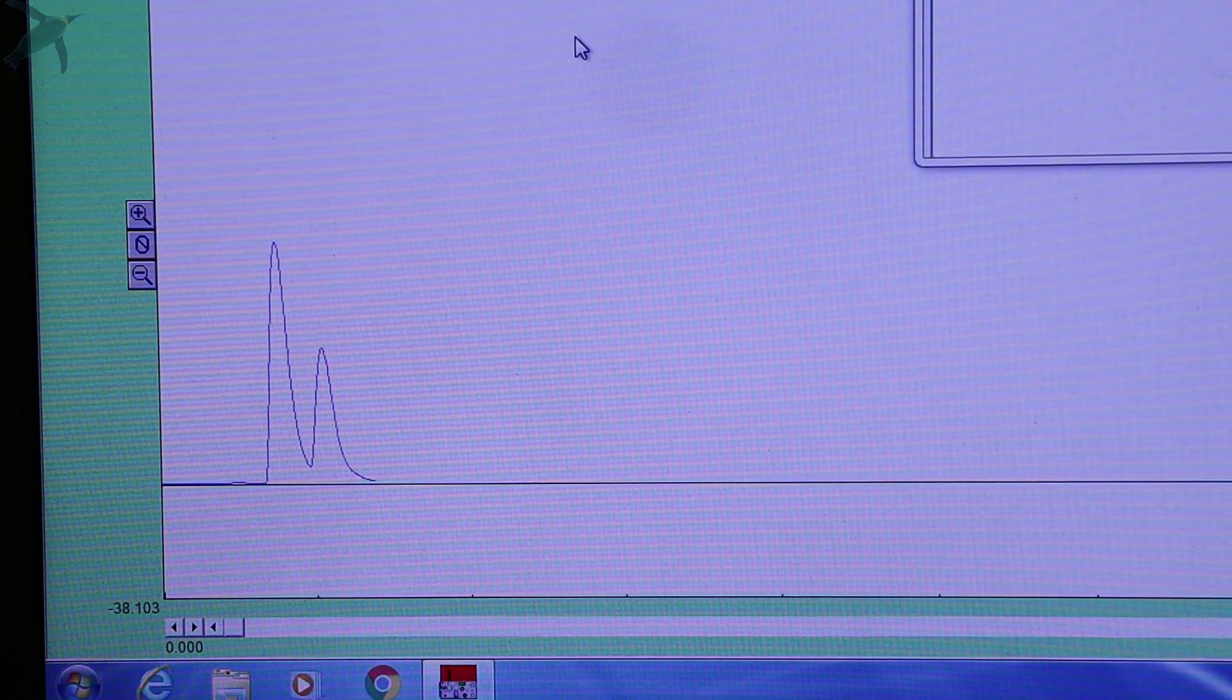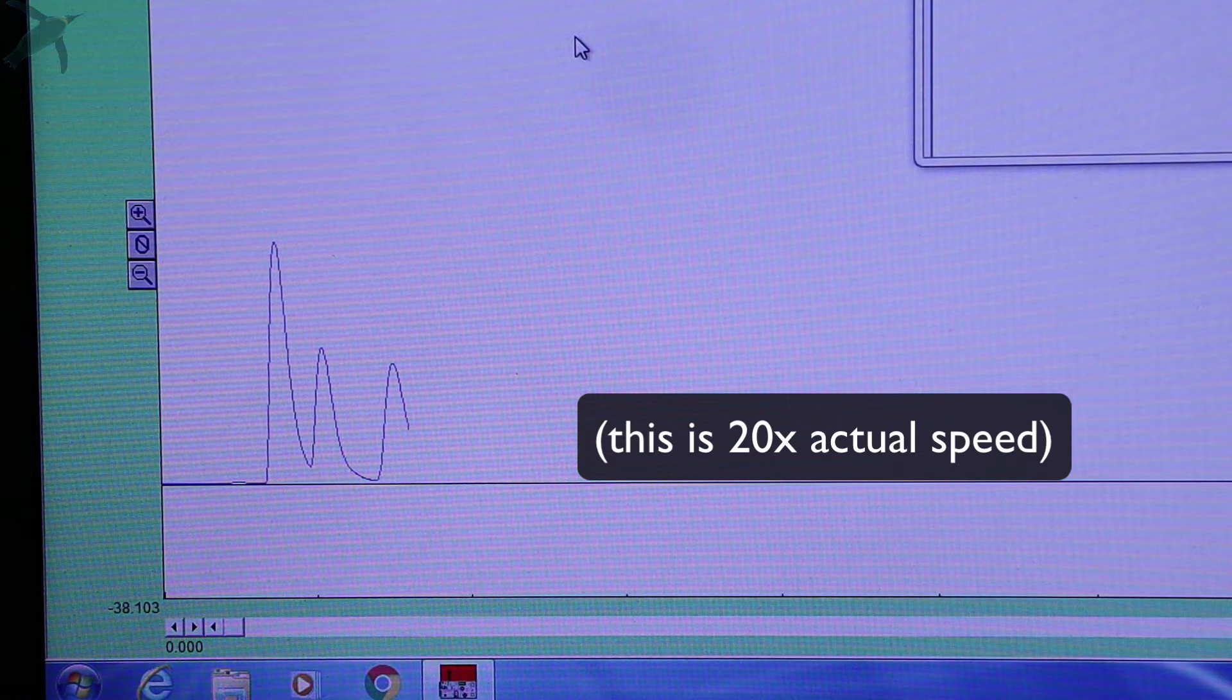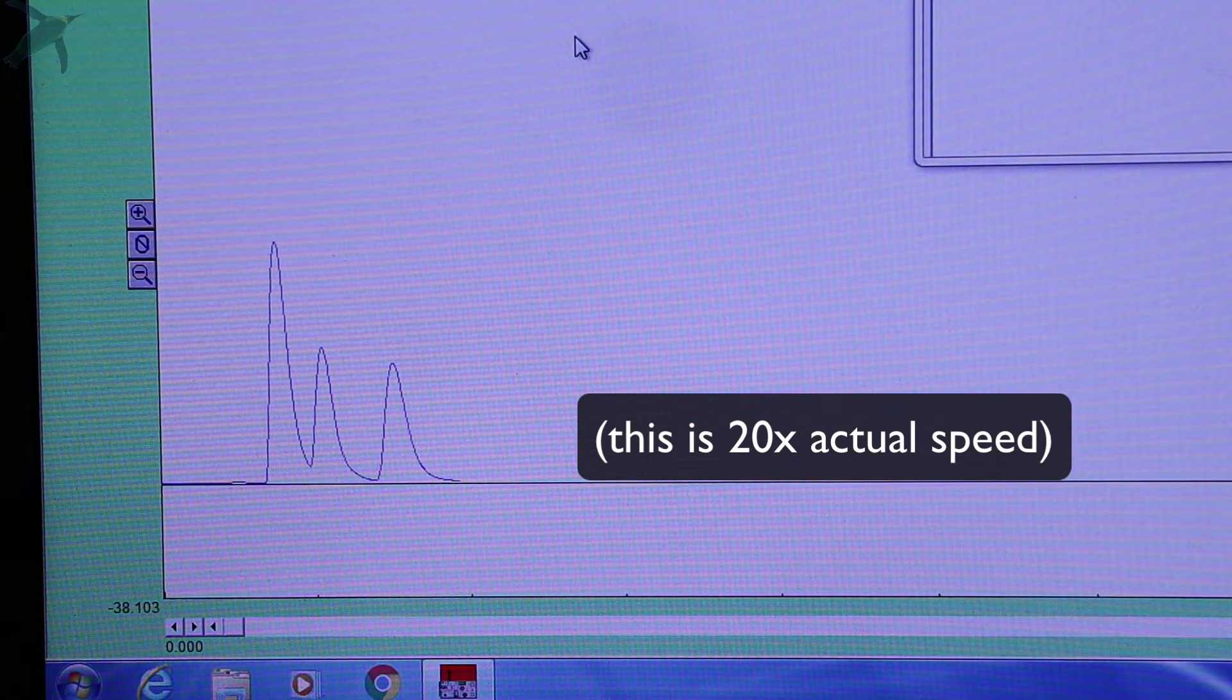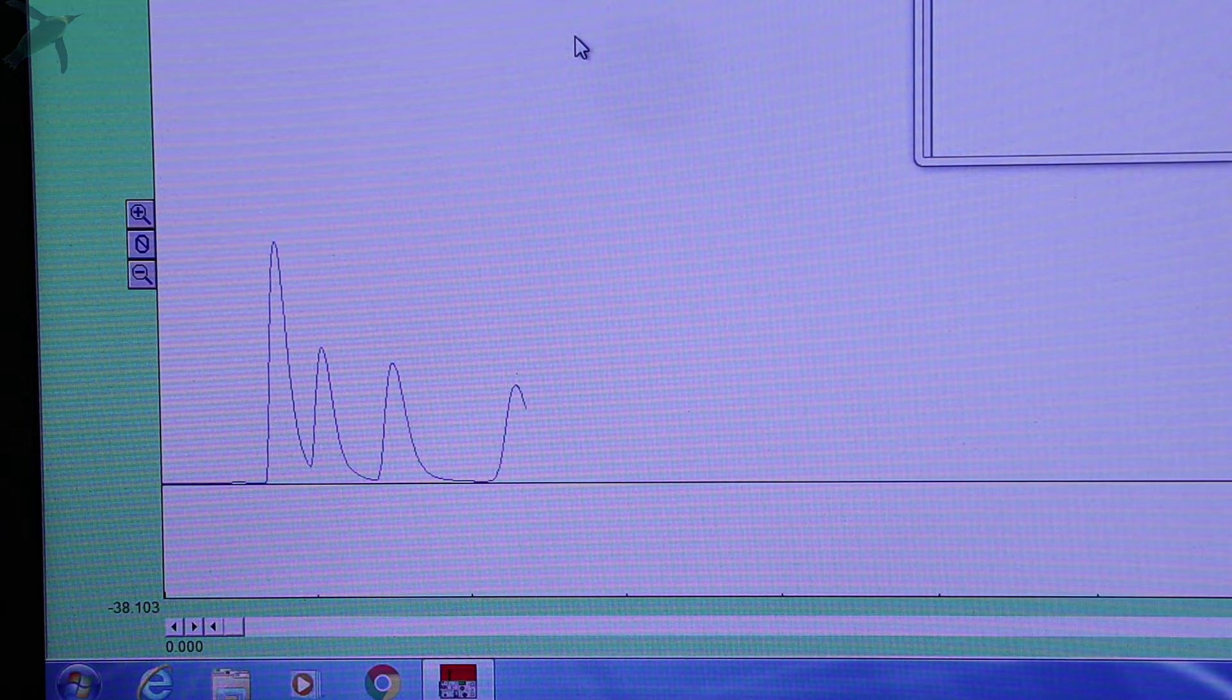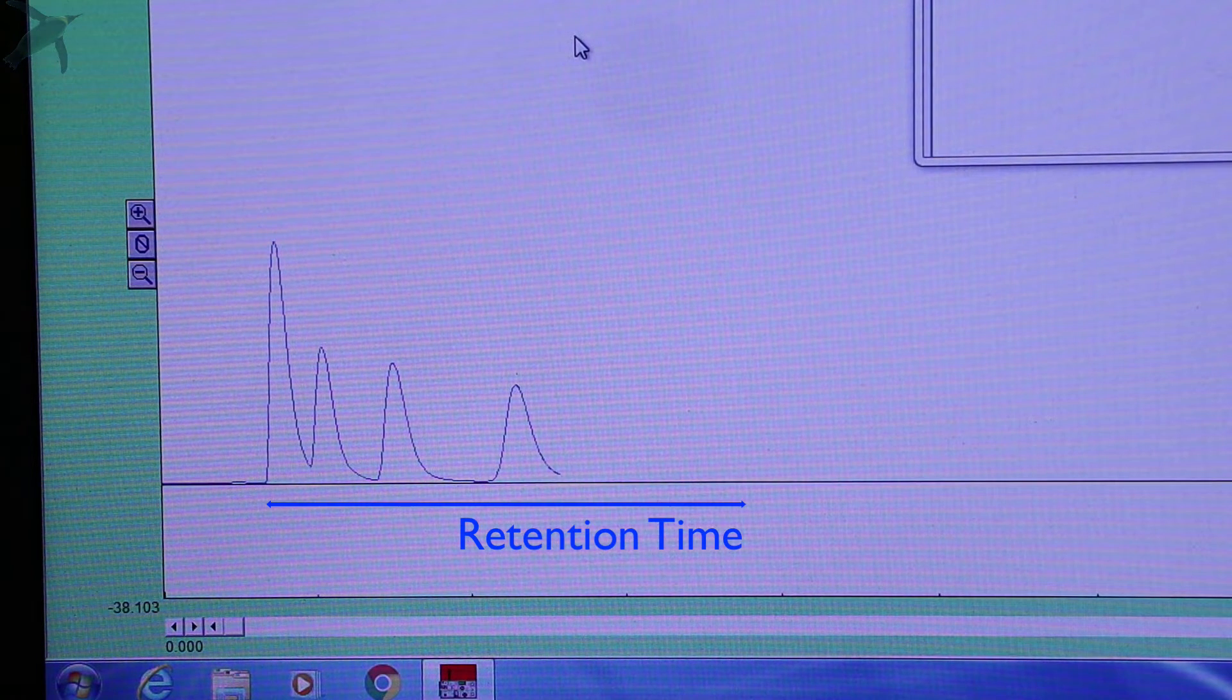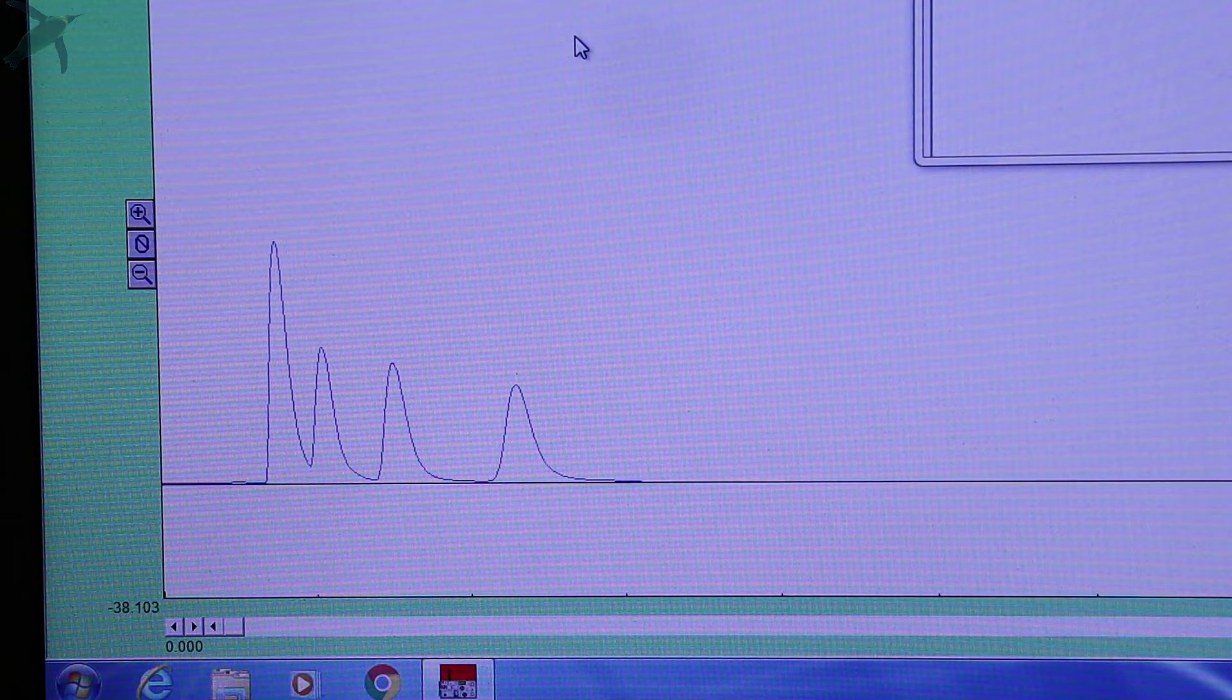This is what the GC computer interface looks like. It's a gas chromatogram, so you have intensity on the y-axis and retention time on the x-axis.